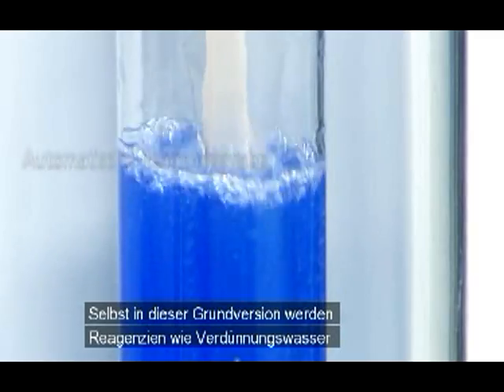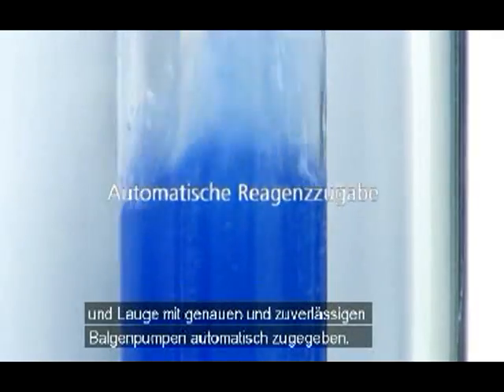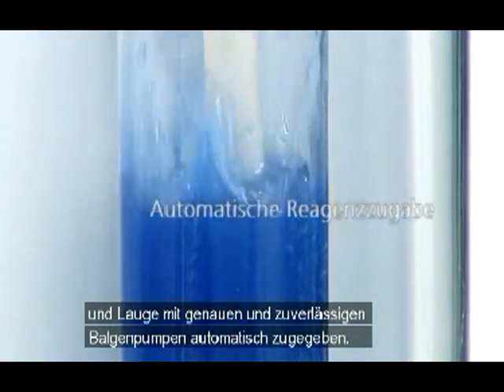Even this basic version automatically dispenses reagents such as dilution water and alkali using accurate and reliable bellows pumps.